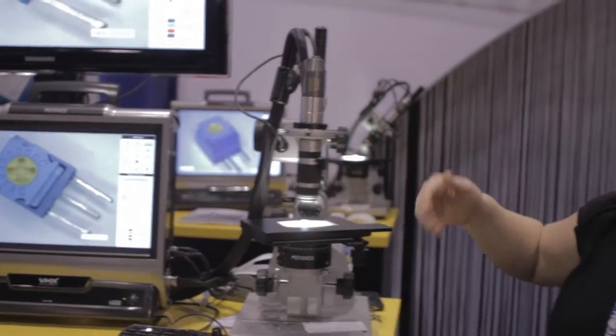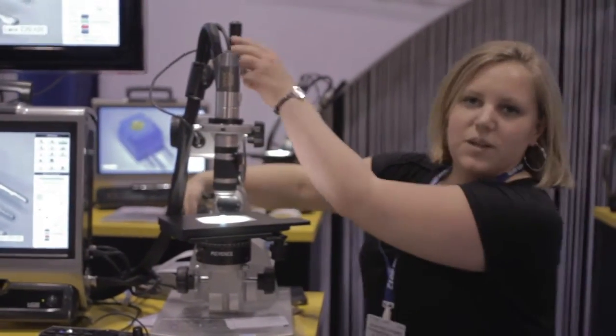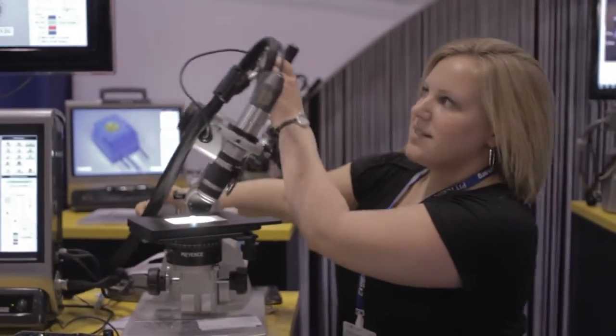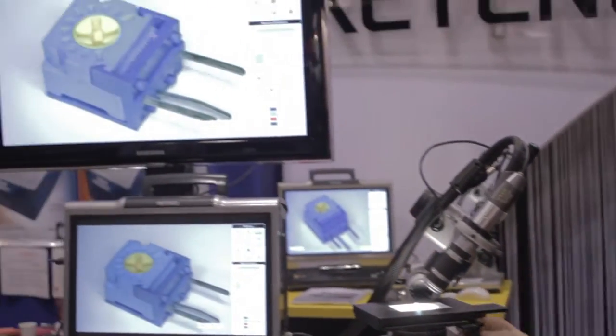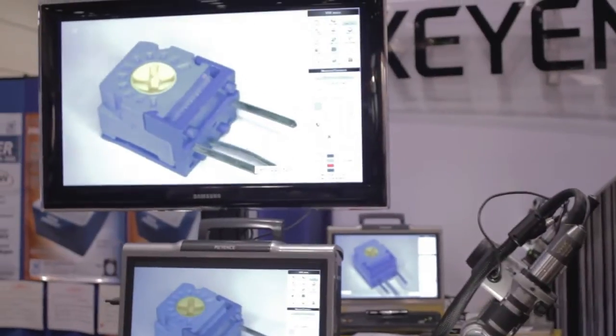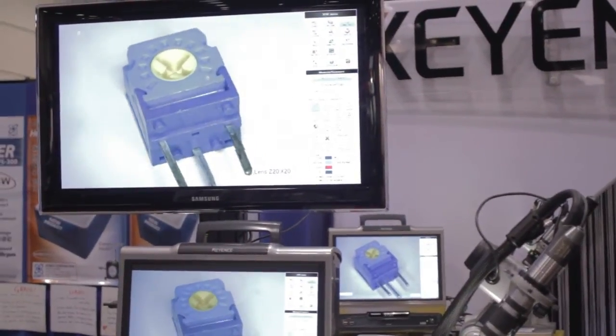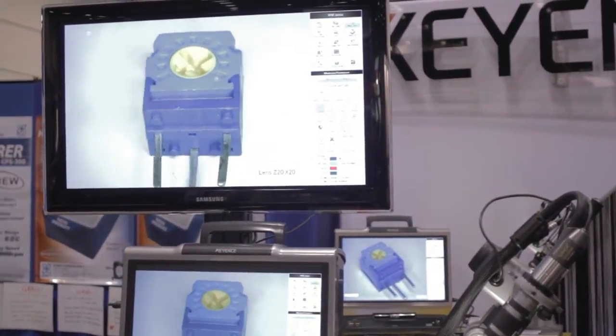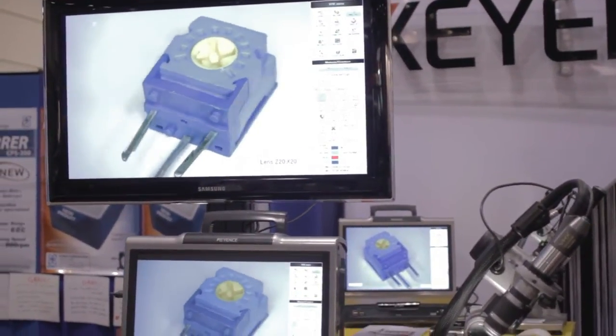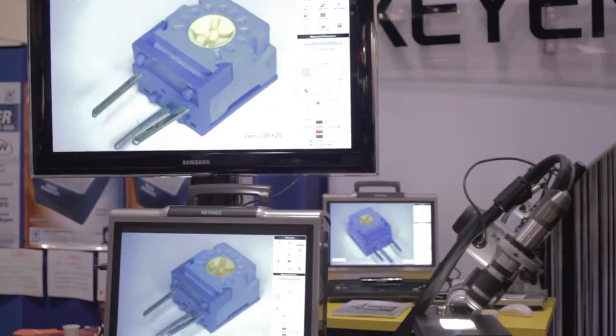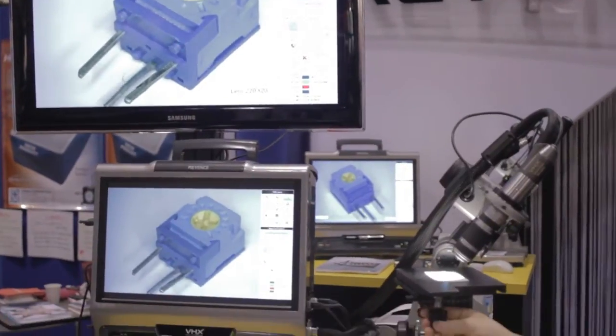What makes this scope really unique is its depth of field. It's got a depth of field about 20 times greater than that of your traditional optical system. So you're just getting a lot more in focus in a single image.